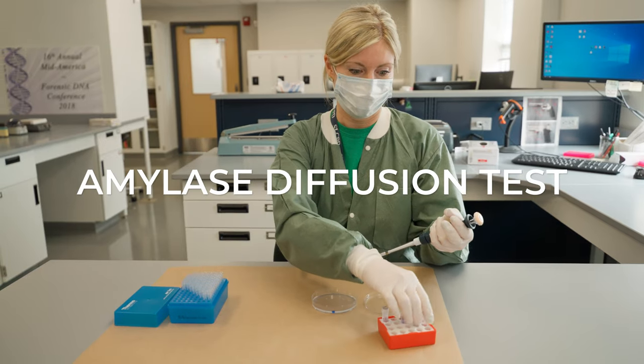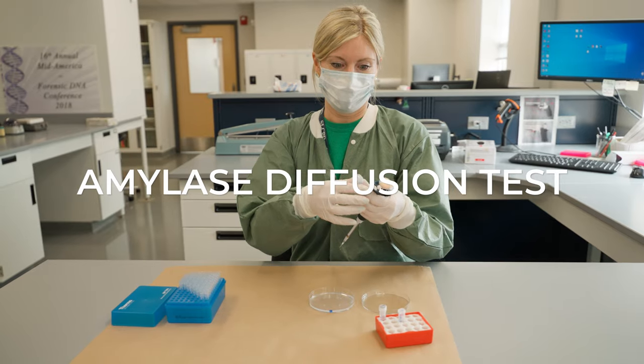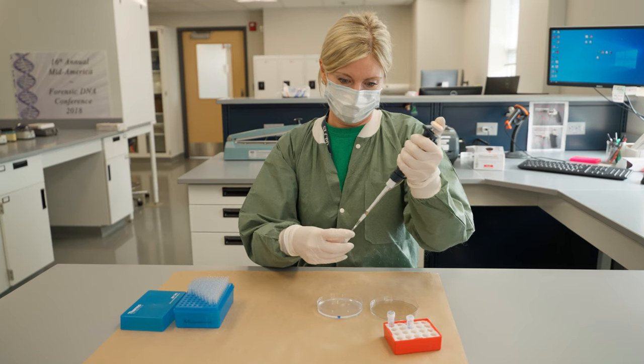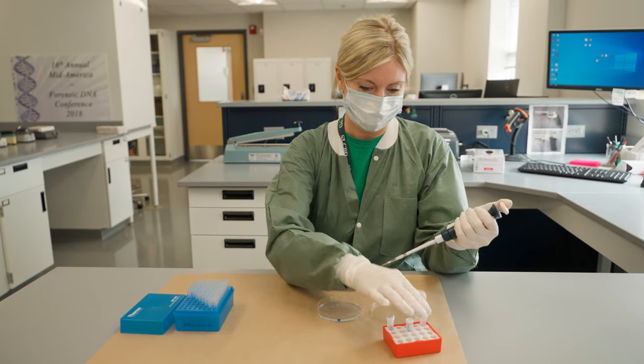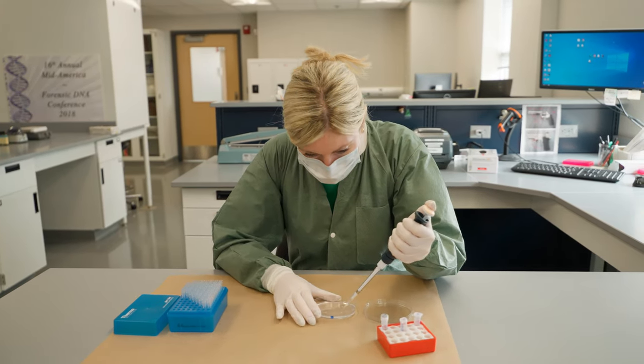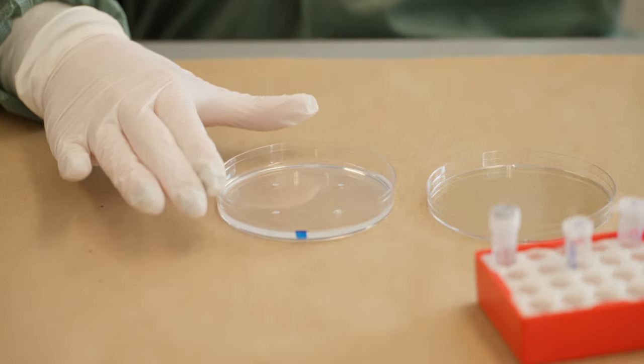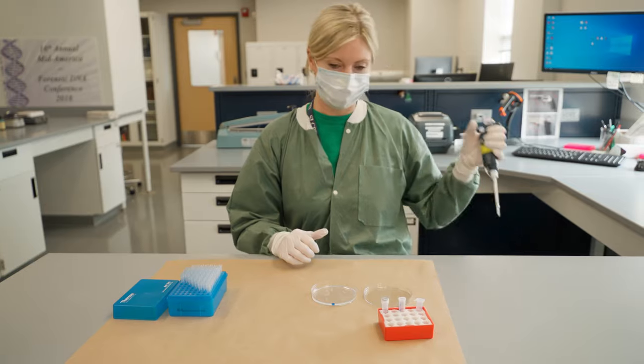The amylase diffusion test is a presumptive test used to indicate whether an elevated level of amylase exists in an unknown stain or swab. If so, this may indicate the presence of saliva. To perform this test, a small sample is extracted in sterile water for approximately 45 to 60 minutes.